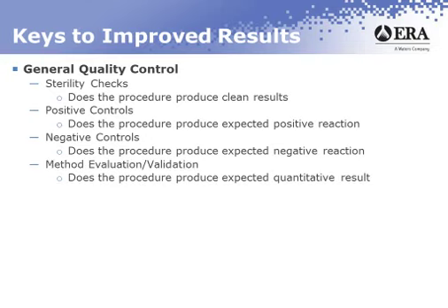Okay. Method evaluation or validation. Does the procedure produce the expected quantitative result? All of the challenges that you're getting in non-potable water are quantitative challenges. So when you do evaluations, when you first put a method into place, you should be challenging it quantitatively.